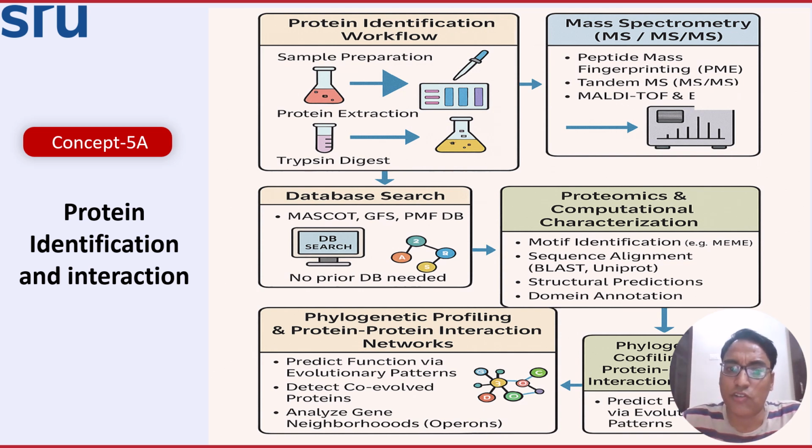Whenever you are working on a protein, you take the cellular sample, extract the protein, and break the protein down into segments using proteases, as the description shown here. Then you do the mass spectroscopy. We'll know the details shortly. Then you search it in the server and analyze the sequences.